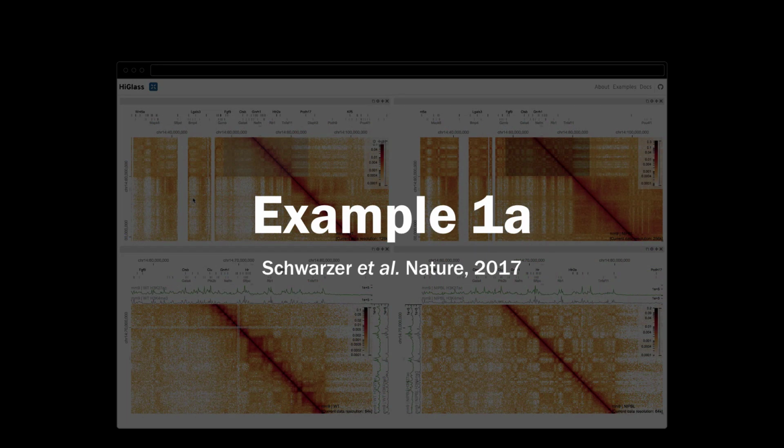So this is from a paper by Schwarzer et al., which came out in Nature 2017, where we rebuilt their figures from my paper in this HiGlass tool. And so what's the problem here? They were looking at mouse hepatocytes, and they had knocked down a so-called cohesin loading factor that they suspected is needed to properly fold the DNA.